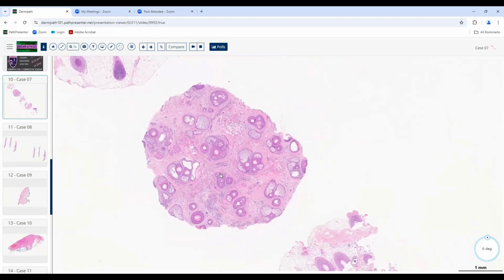So if you look at a horizontal, routine section of alopecia taken from somebody that's got androgenetic alopecia, it really looks almost like a biopsy from their face. The follicles are smaller. They're not really rooted in subcutaneous fat. You only have about maybe 4 or 5 or 3 of them as opposed to 10, so about 50% or less of the number that you should have there. So it looks almost like a biopsy of somebody's face with lots of sebaceous lobules and smaller follicles. So that's a way you can tell androgenetic alopecia almost instantaneously at low magnification when you see that pattern.